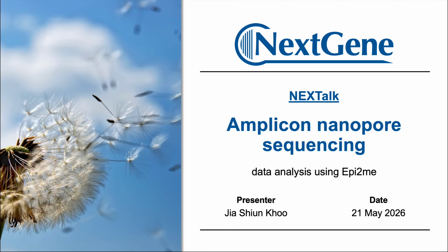Maybe there's one more question. Yes, sorry, can nanopore be used for ITS fungus? Basically, we can sequence any amplicons, including but not limited to 16S, ITS, 18S, even a COI region. As long as you can PCR amplify it, we can sequence it under the amplicon protocol that I shared earlier. Therefore, we can do custom sequencing like HLA, and also SSR, simple sequence repeats, that kind of thing. Yeah, thank you.